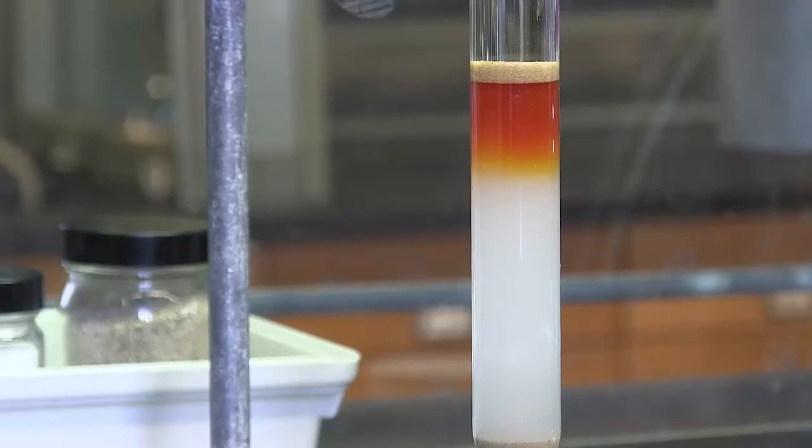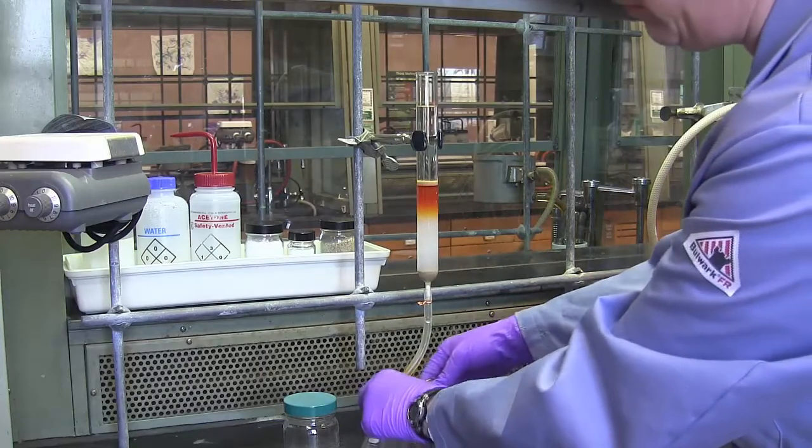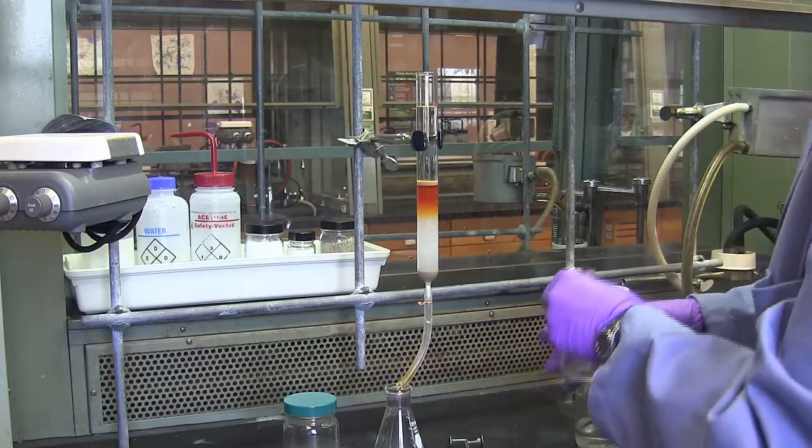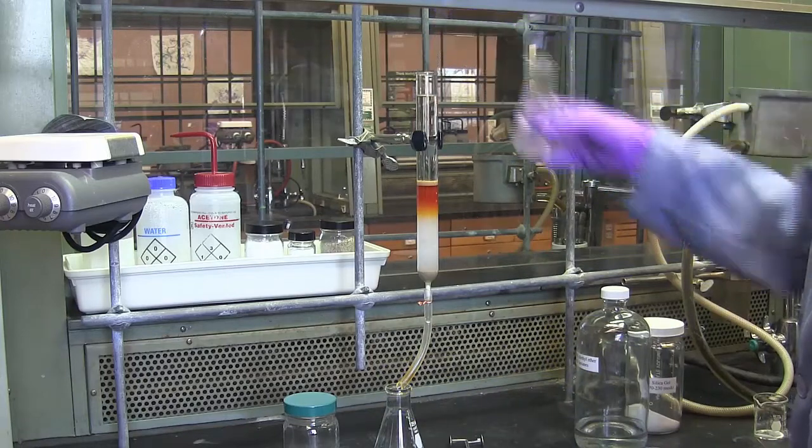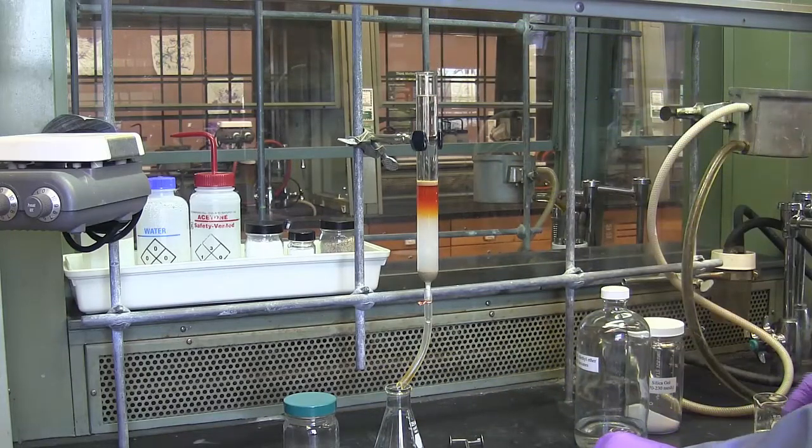When the components begin eluting, you would simply switch collection flasks to collect each band as it elutes. There's clean solvent coming out of the column now. You could begin collecting your first band now, but it's nothing but solvent that would need to be evaporated on a rotavap, which takes time. So I typically wait until the first component approaches the bottom of the column before I begin collecting. As long as a sample is not yet eluting from the column, you can recycle your solvent. Once bands begin to elute, do not recycle the solvent onto the column.